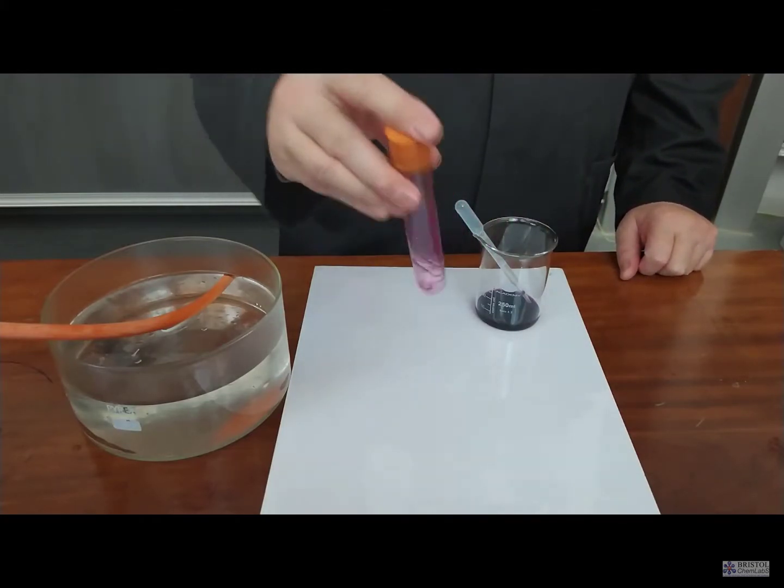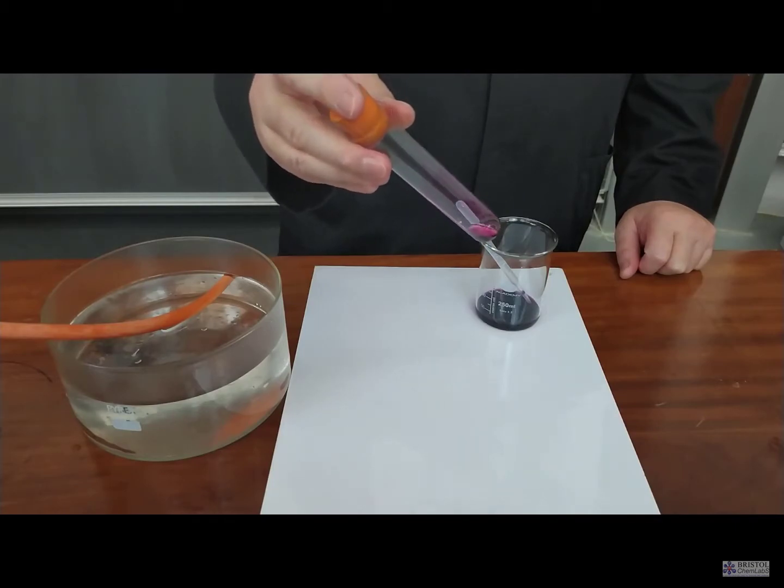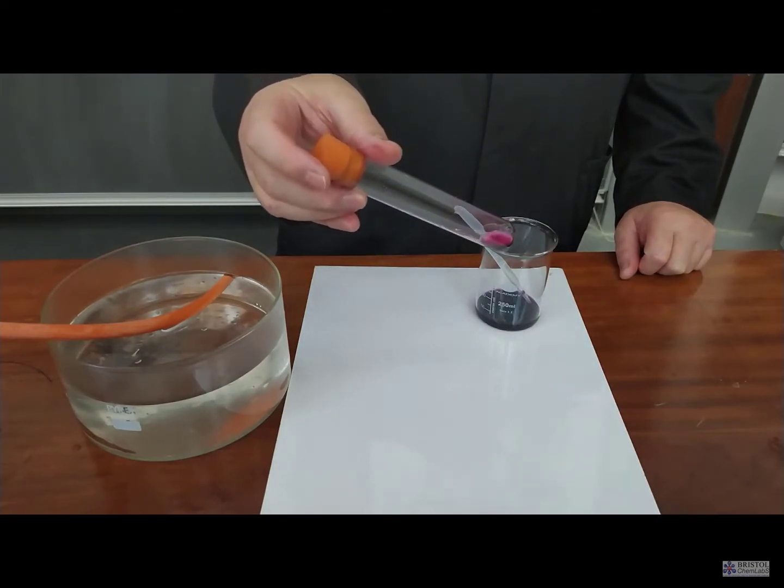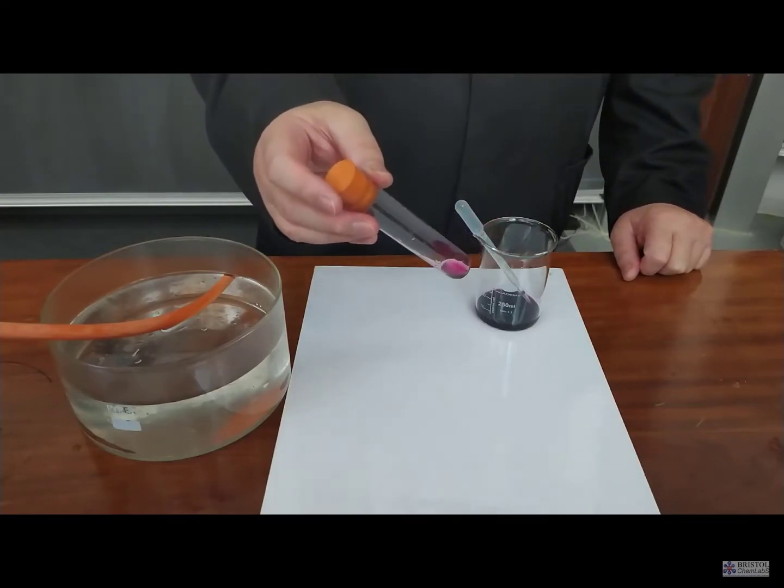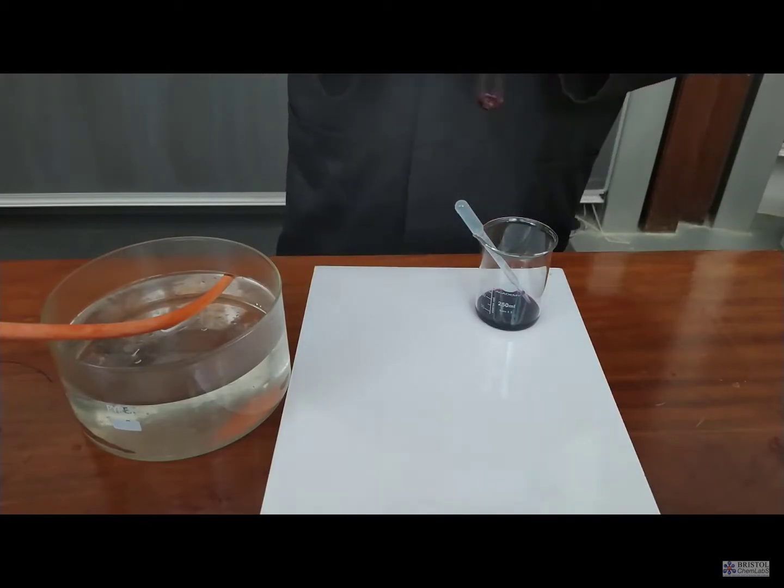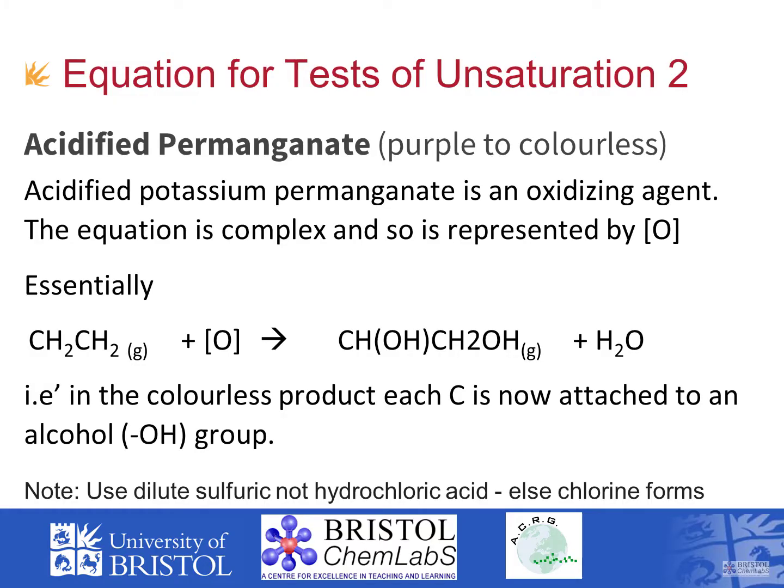To do this properly, you would need to add just a few drops of very dilute potassium manganate VII solution, and the color changes from purple to colorless. Acidified potassium manganate VII is an oxidizing agent, but here it simply adds an OH and alcohol group to both carbons either side of the double bond, making a diol—ethane-1,2-diol—which happens to be used in antifreeze.